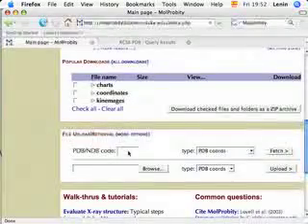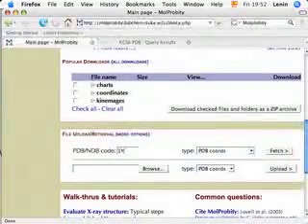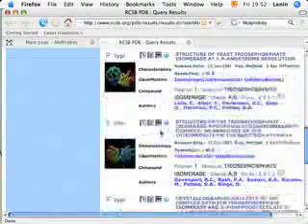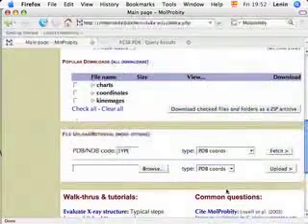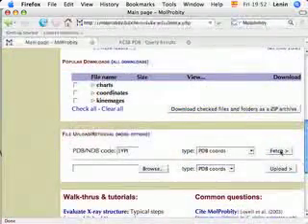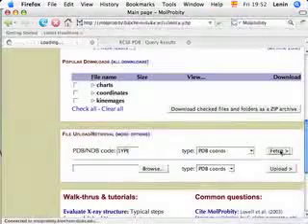We select the PDB ID and type it in the MolProbity webpage. We will follow the same steps as before for the low-resolution structure — that is, the loading, the protonation step, and the full atom analysis.